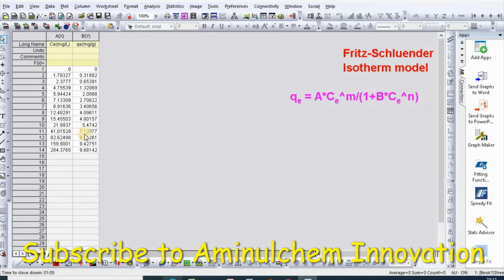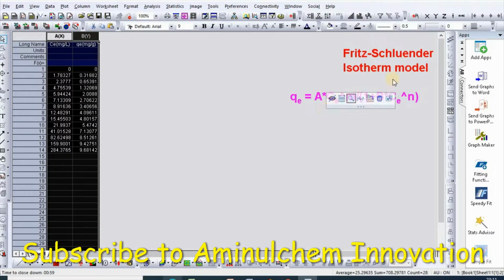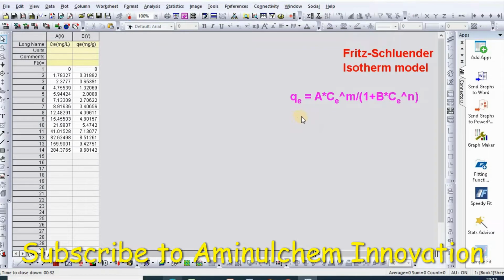Well, in order to fit, I have taken equilibrium adsorption data, and the Fritz-Schlünder isotherm model has 3 forms. One of the most important forms is Q equal to A C to the power m divided by 1 plus B C to the power n, where Q is the amount adsorbed at equilibrium, A is the Fritz-Schlünder model constant, C is the equilibrium concentration, m and n are Fritz-Schlünder model exponents, and B is also a constant.